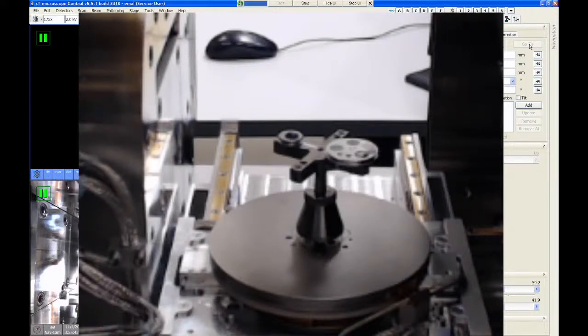The only reason I say slightly above the max line and not exactly at max is because it's rather tedious to try to get your samples to be exactly at the bottom of the gauge. It's easier just to be a little bit taller, so the gauge just catches on the side of your stubs.